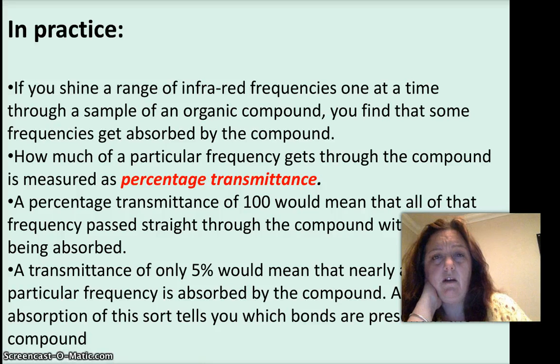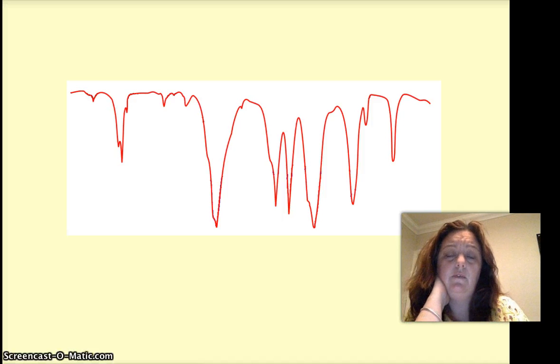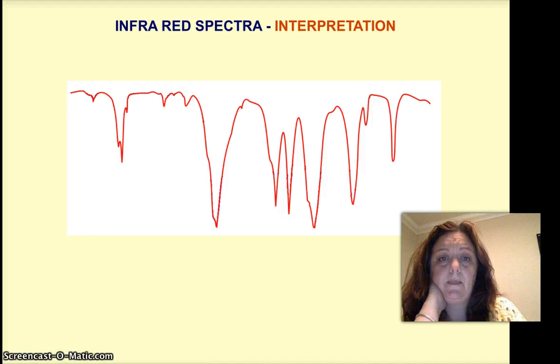It's a very high absorption, and that will tell you what bond is present in the compound, because it is a high absorption of that particular type of radiation. Here's a spectrum, so you can see there's a series of what you would look at and say were troughs because they're pointing downwards, but actually infrared spectra are referred to as having peaks.